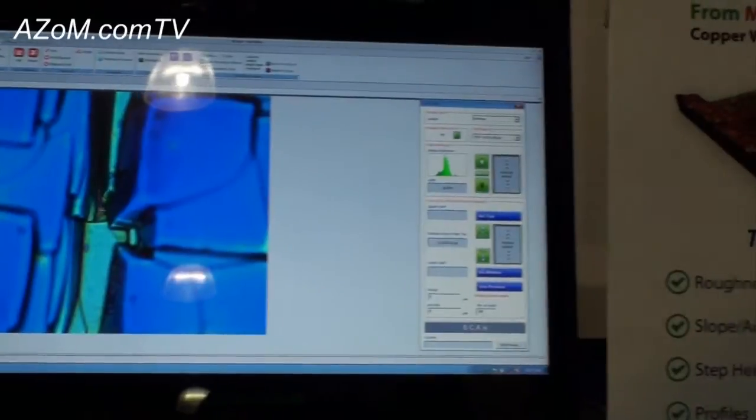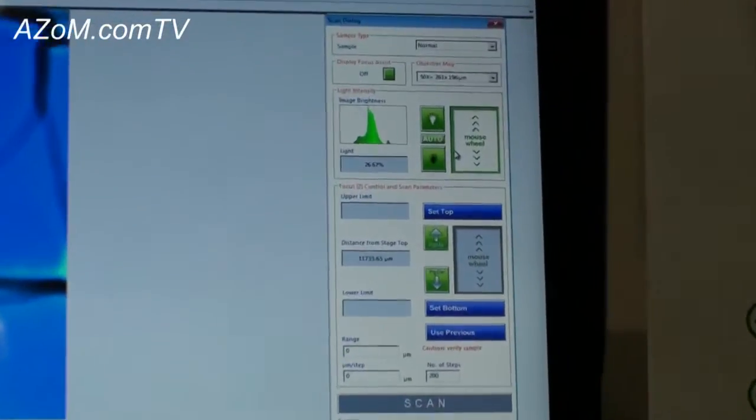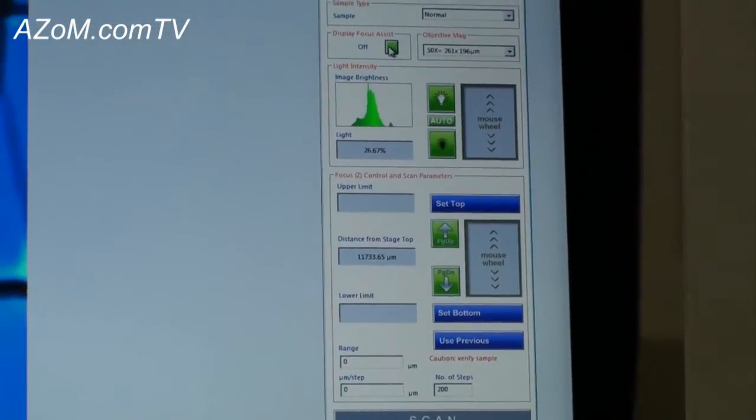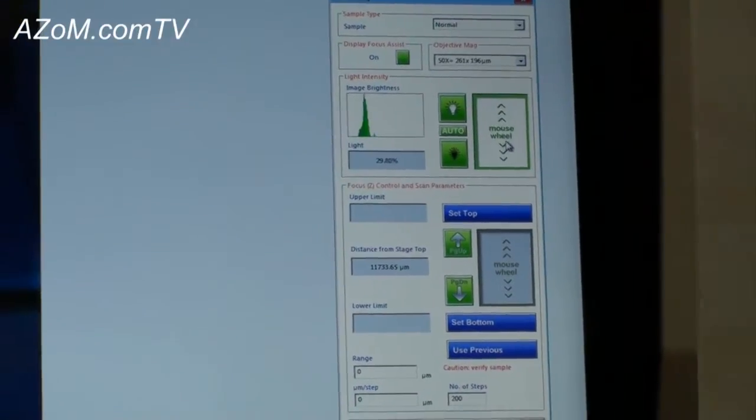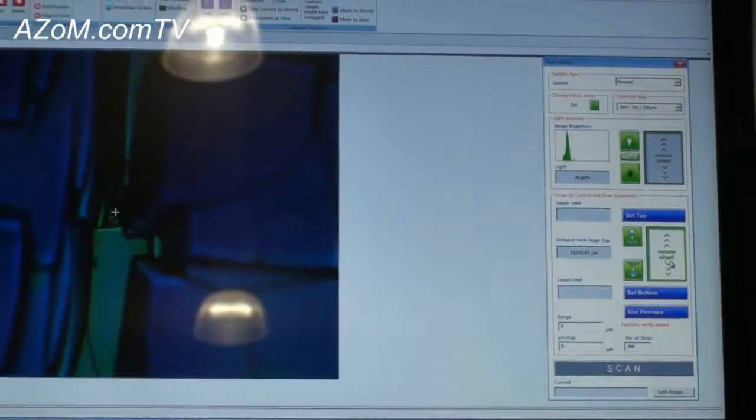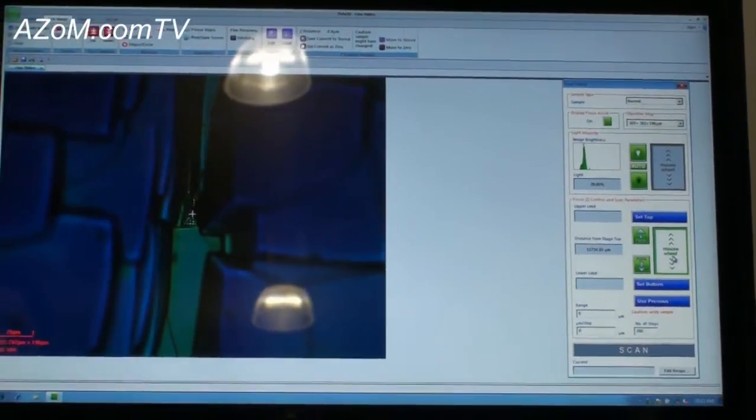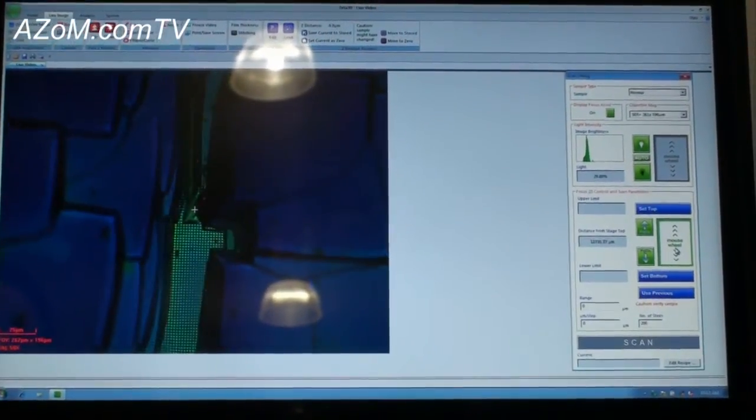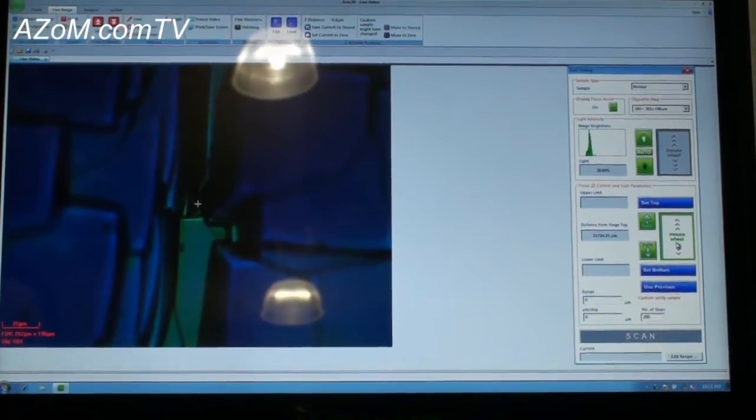The next step is to set the ranges, but what I'll do is actually turn on one of our proprietary capabilities which allows us to enhance this. And that is our focused assist. It allows me to easily see which plane is in focus, so the region in the center is actually our highest point.